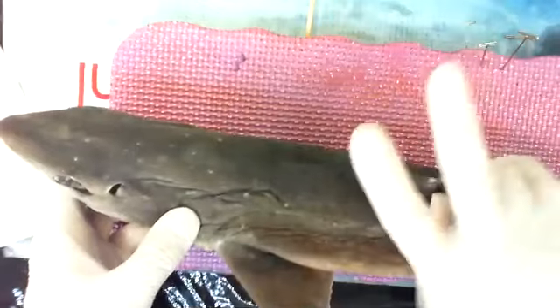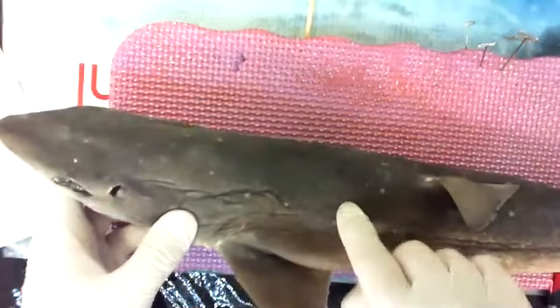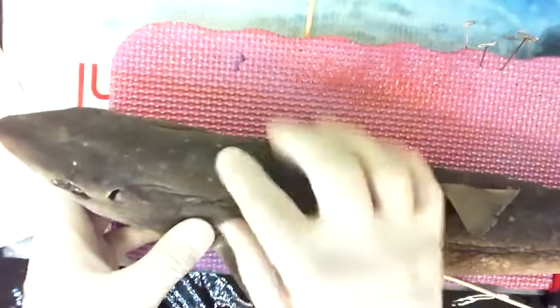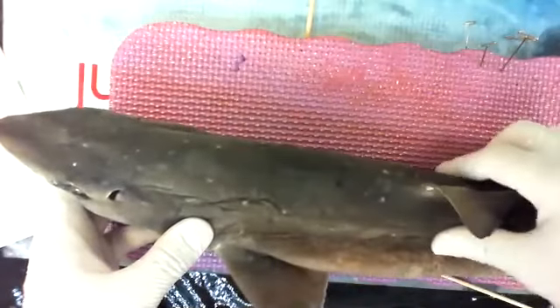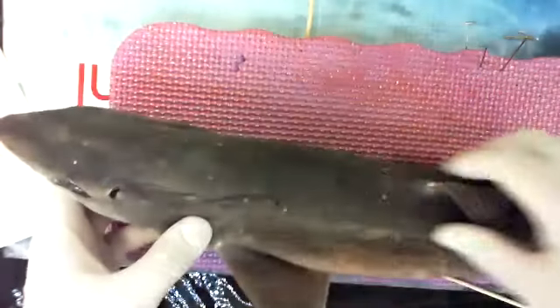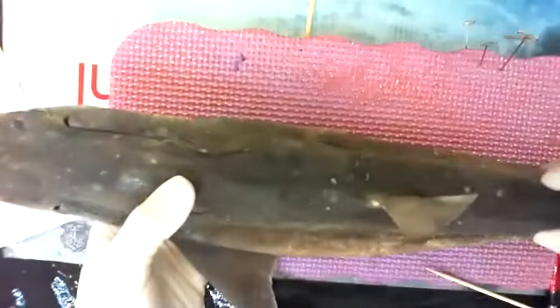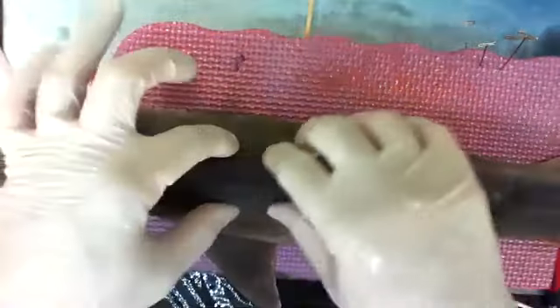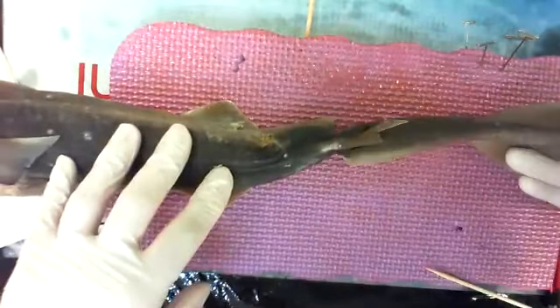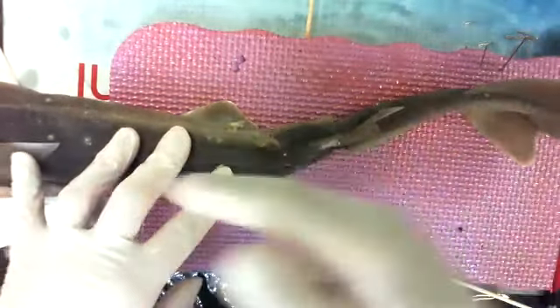Locomotion means movement. There are two systems, muscles and bones, right? Skeleton. No bones in the fish, so it has to be a skeleton. When you look at the muscle, all this dense material is muscle. There's muscle in here. It's a little flabby, but muscle. When you look at the shape of the shark, they're kind of like a torpedo. And the muscles are really strong going along their spine so that it can twist little parts here, not all at one time, but individual sections. A shark doesn't typically use its caudal fin for a propeller. It uses it more like a rudder. It turns. A propeller pushes the boat. A rudder steers the boat.